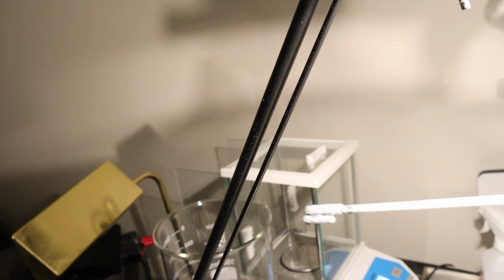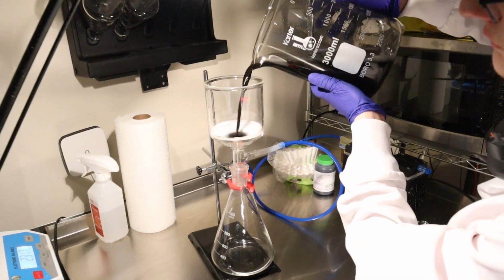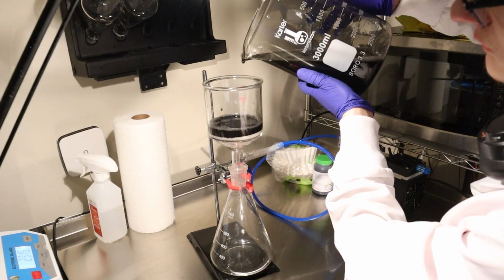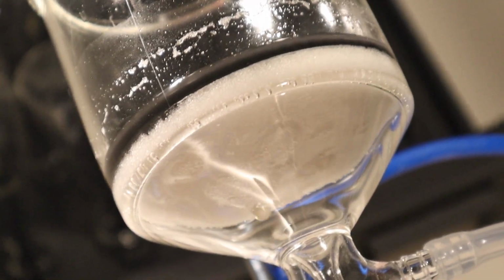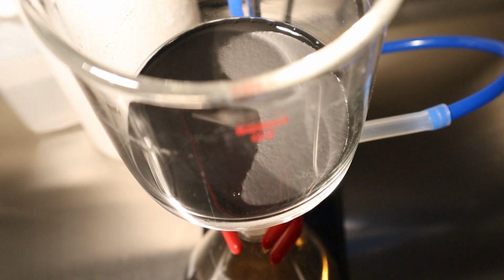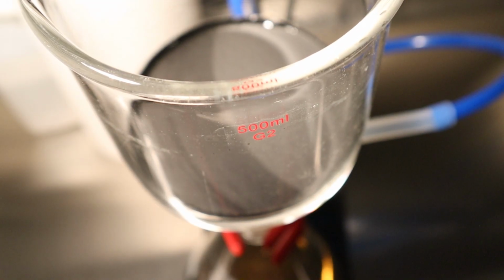I removed my stir bar, swirled the beaker to suspend the charcoal stuck to the bottom, and ran 500 mils through the Buchner funnel and turned on the pump. This was not as fast, however, so after around 1 hour, I had a nice dry charcoal bed. But this was so slow, I decided it would be faster if I did the remaining 500 mils separately.